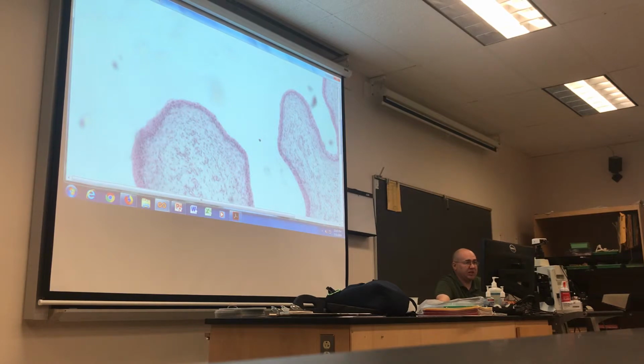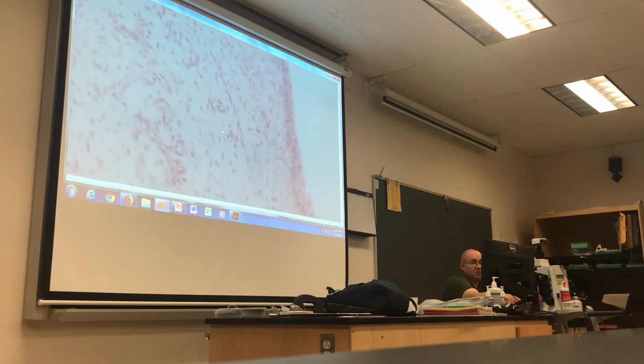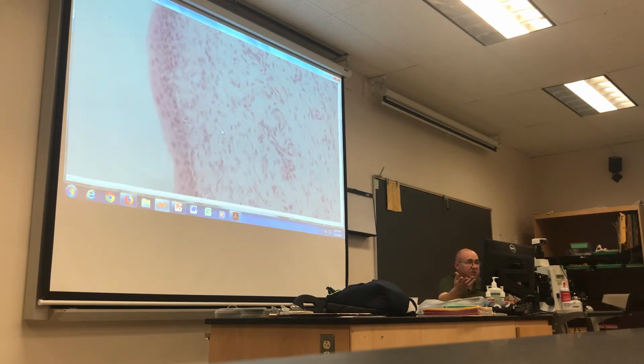So we have this epithelial tissue lining the bladder that you're seeing right here. We can zoom in on it, so you can see a little bit better, but you should automatically know what that epithelial tissue is without even looking at it. What's it gonna be? Transitional. It's transitional epithelial tissue, right? See lots of different shapes and sizes in there because it's stretchy stuff, right? So when we're zoomed in this far, what we're seeing right here is the transitional epithelial tissue, and then the submucosa is just all the dense connective tissue hanging out down in there.